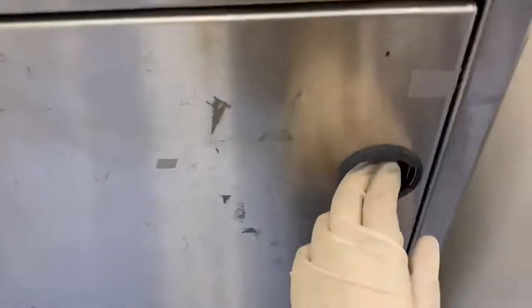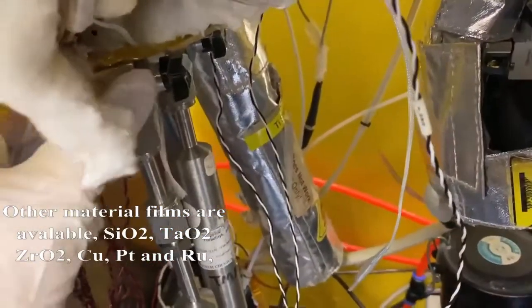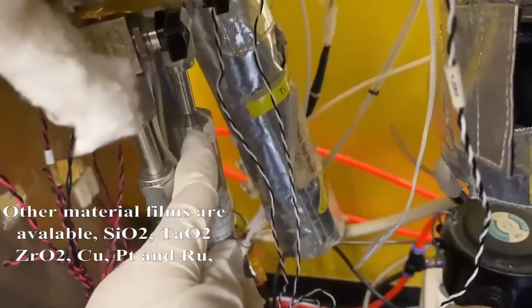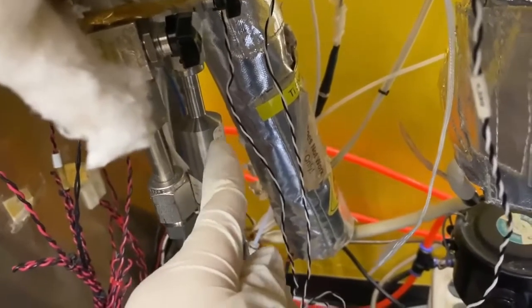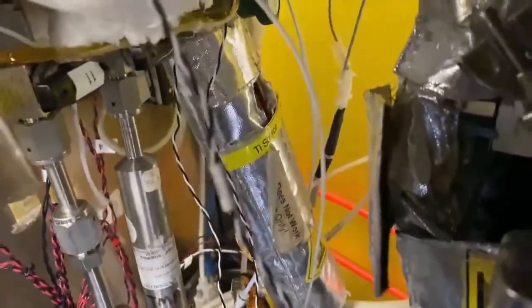And then open the door of the machine. The precursors are located here. The first one is the water, and the second one is the precursor for aluminum oxide, which is the trimethylaluminum. And the third precursor is for titanium oxide deposition, and that is titanium chloride.